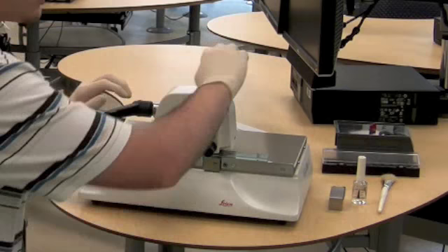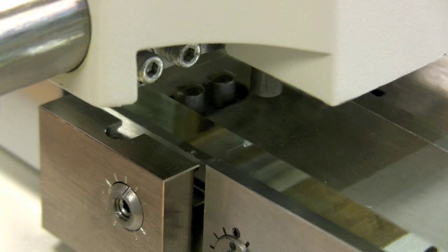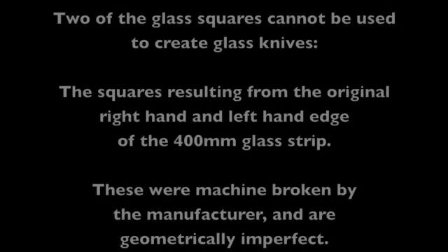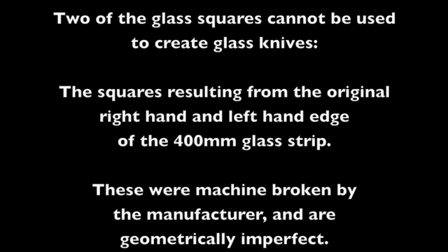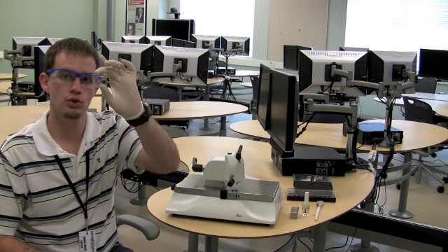And again, we'll score the glass quickly and evenly. And then turn the breaking lever and break this piece of glass. We're going to repeat this procedure two more times until we're left with only one 25 millimeter square of glass. We finished taking our 400 millimeter piece of glass and turning it into a 25 millimeter square.